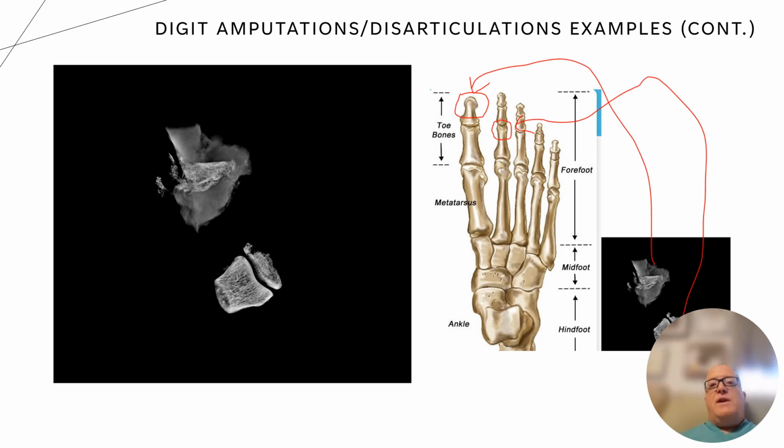It's also important for teaching purposes, especially with residents and PA students that don't have this anatomy down yet, or don't think of this as being important. You really have to be accurate with all this stuff. The pathology report is a legal document, and you want to be accurate. So you want to be not only efficient, but make sure everything's correct.